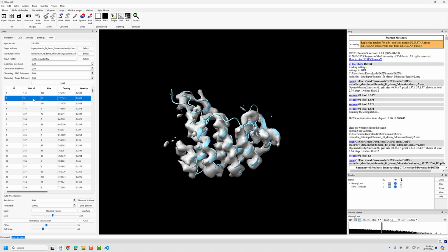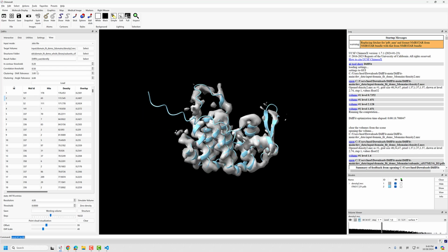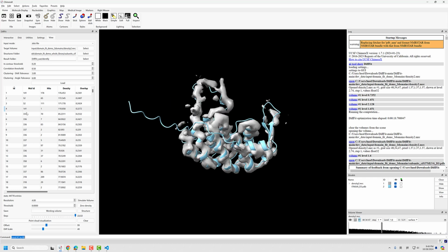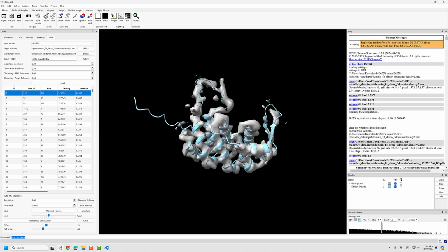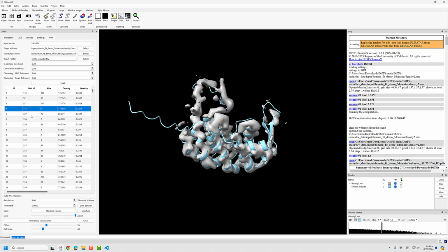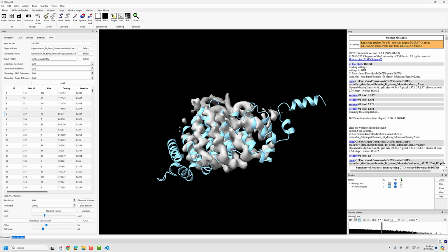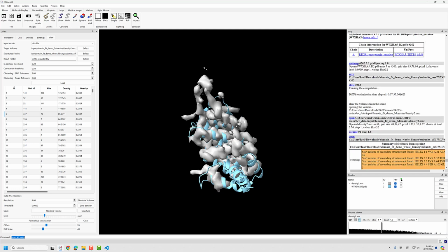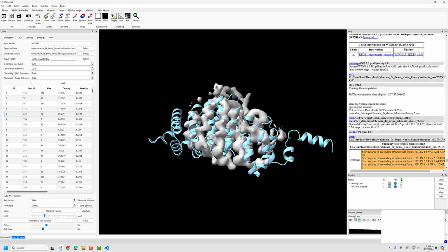Now these two are slightly shifted, but if we increase the clustering threshold, they will be grouped into one cluster. And then we can take a look at the other one here. This is with the same ID as the first hit. It's slightly shifted. Well, this one has some helices well aligned, while others are not.